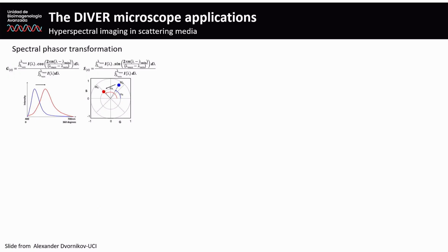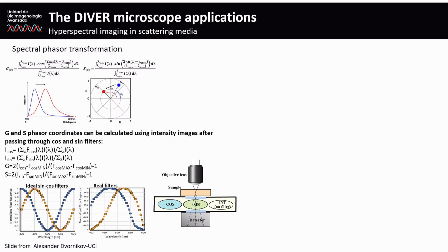The last thing that I want to mention is that this microscope is also compatible with hyperspectral imaging. In hyperspectral imaging, we need to collect step by step the different wavelengths to recompose the spectra. Then we use this in the spectral phasor analysis, which is a Fourier transformation of the hyperspectral data. But Enrico came up with an idea 5 or 6 years ago in which, if we collect the data in a modulated spectra, we can do the phasor transformation on the optics, and not using mathematics.